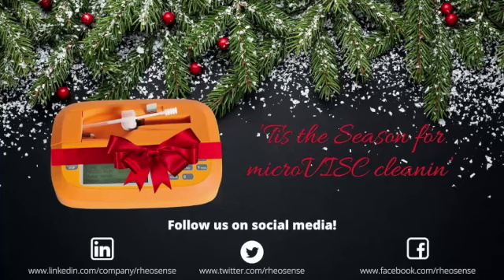And how long does it take? For the cleaning station, we have some default protocols, but it depends on the chip you use. For A chips, we want to protect the chip and not damage it so you can keep using it. It usually takes around 10 minutes. For B chips, it's around 7 minutes, and C and E can usually be around 5 minutes.